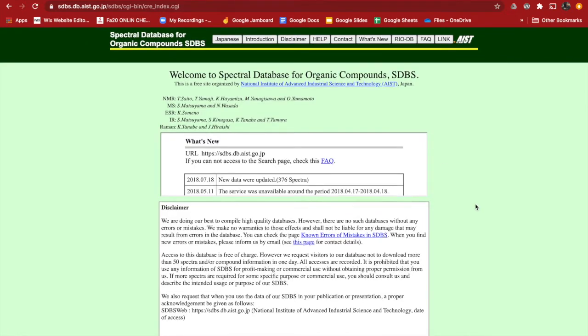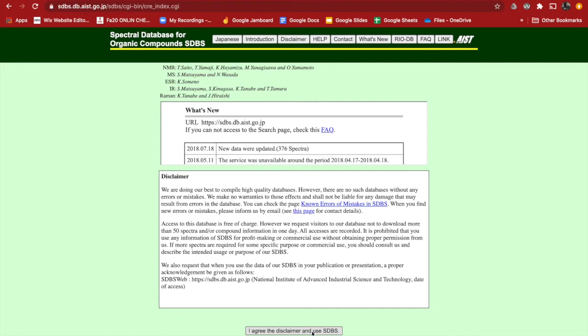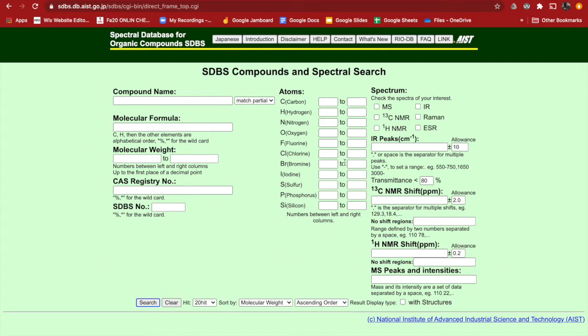And it asks you to agree to these disclaimers. Boom, I agree. I totally agree, 100%. And then I'm here, and you can do some searches here.